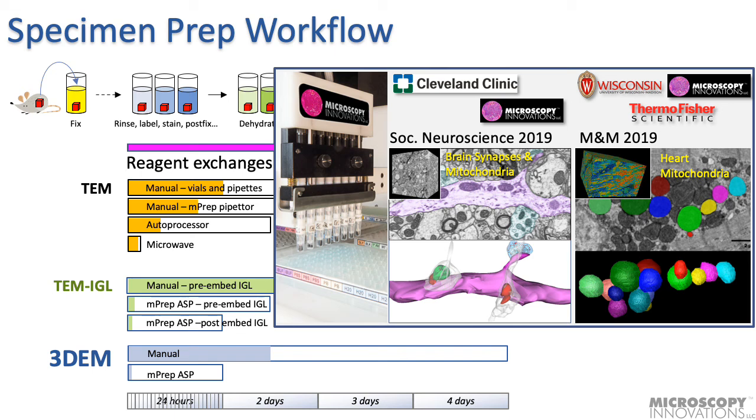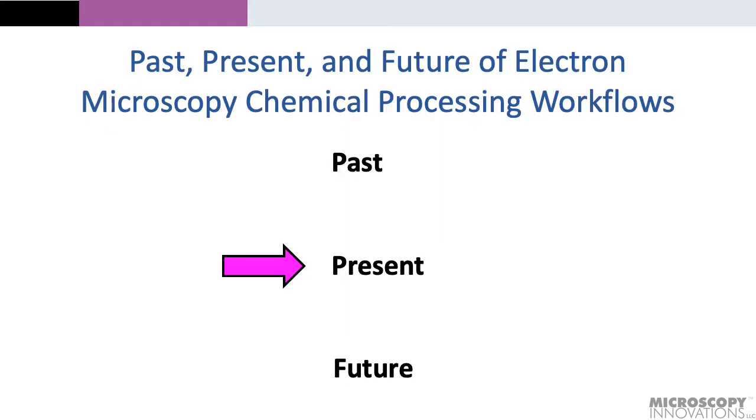This work, done with pediatric clinicians at the University of Wisconsin, acquired 50 micron 3D volumes of heart, and they were used to analyze how mitochondrial shapes are altered in premature infants that spend time in high oxygen incubators. These are the mitochondrial shapes. I believe that this type of 3D image data would have been amazing to the pioneers.